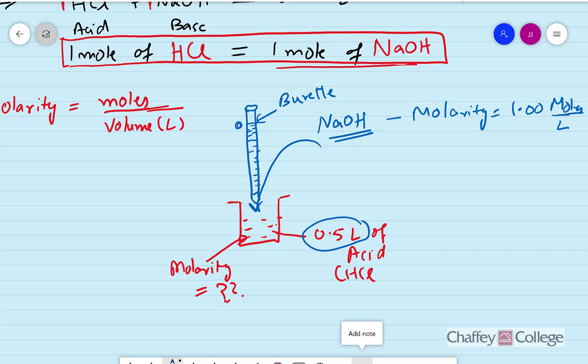There is a nozzle and a valve on the buret. We open the valve and start adding the base. In the beginning, a small quantity of base is added, which neutralizes some of the acid. We keep adding the base until all the acid is neutralized. Once the acid is completely neutralized, we stop this addition.